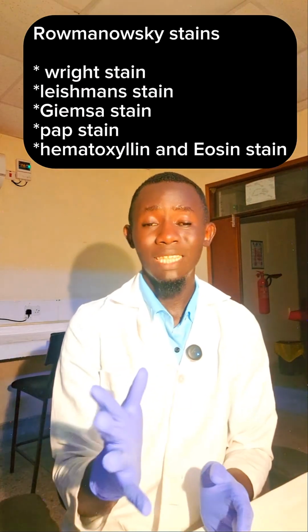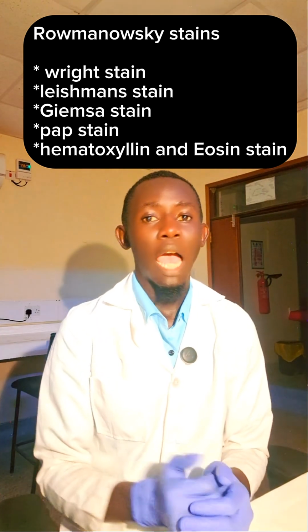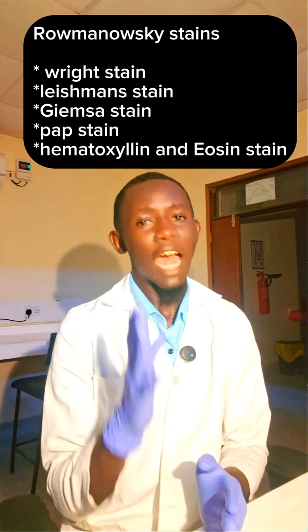So a good example, I'm gonna give you different types of stains we use in the laboratory. We have the Romanowski stains, we have the Wright stain, we have the Leishman stain, we have the Giemsa stain, and we also have the Pap stain, and also the hematoxylin and eosin stains. These are just some of the stains that are used in the laboratory. But we have one very important stain that is used in microbiology, which is the gram stain. So gram stain, I'm gonna give you a quick and basic way to understand this gram staining technique that is used in microbiology.